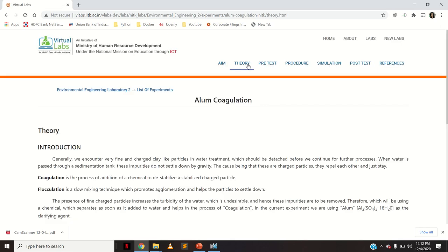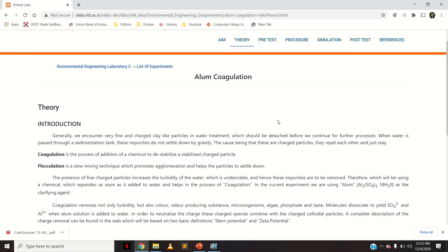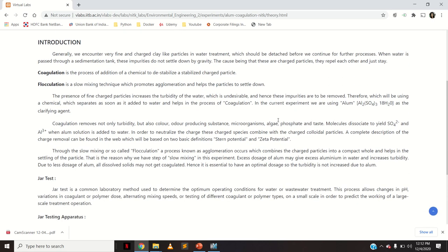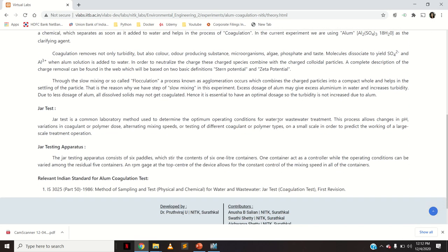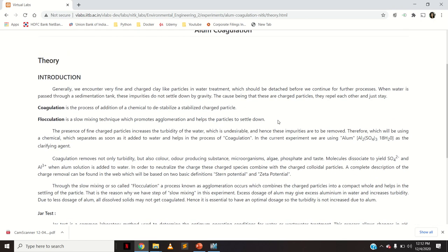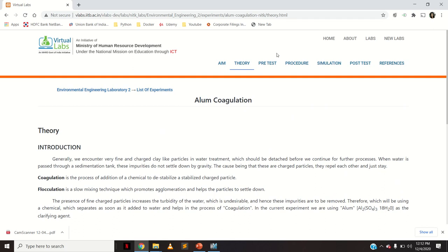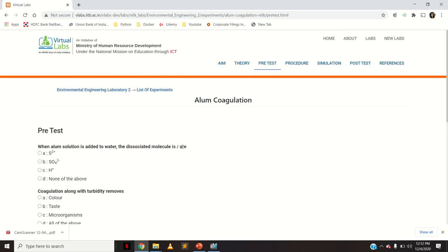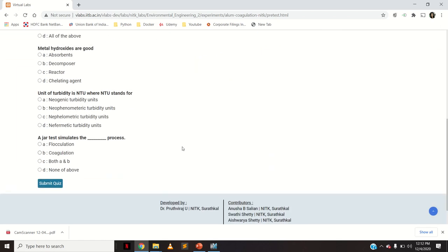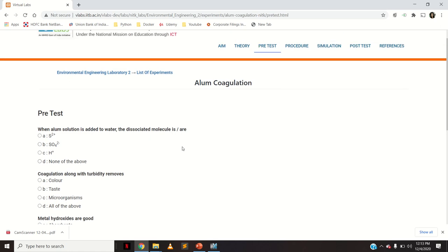When you go to the theory part, it shows the theoretical background of the experiment — what is coagulation, what is flocculation, what is the jar test apparatus. All these things are present in the theoretical part. There is also a pre-quiz that you could attempt and submit, covering the basic knowledge about the particular topic.